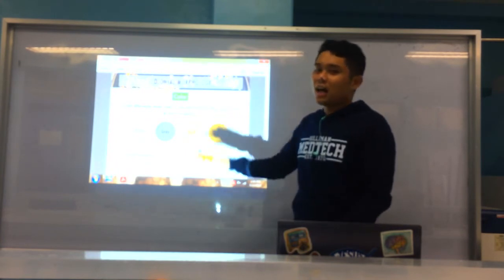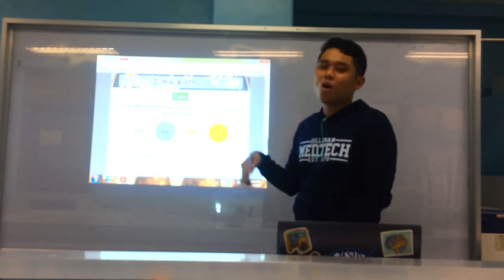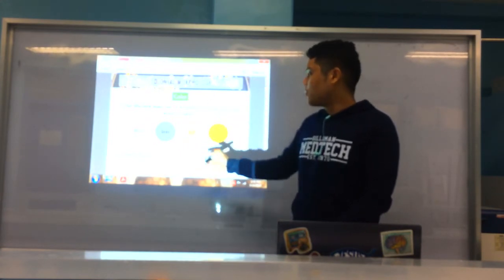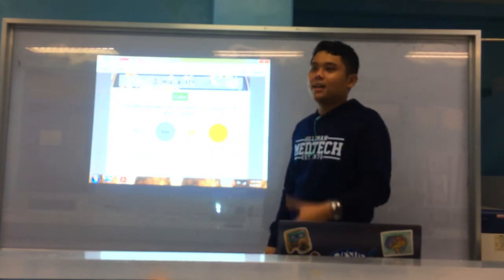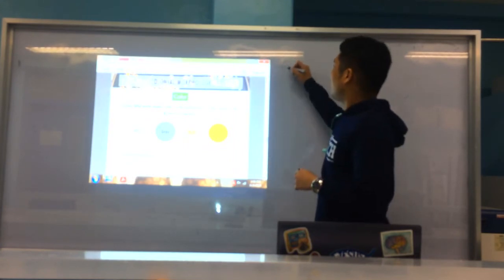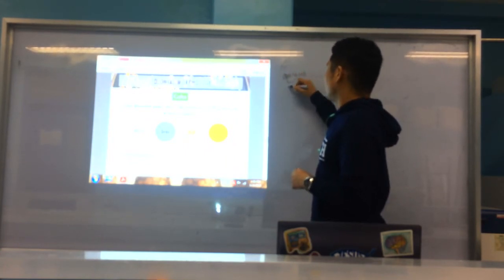So again, there's a lot of colors, no? Pwedeng white, gray, buff, yellow. Usually, most of katong mga common na bacteria, usually mga white colonies na sila, or gray, na iba na buff. Yellow, very obvious. Sa BAP, you have creamy, yellow, butyrous, buttery looking. Diba? Press the buzzer, sino yan? It's Staphylococcus aureus. Muna siyang aureus, di ba? Aureus, because aureus means gold. Okay, di ba? Di ba?